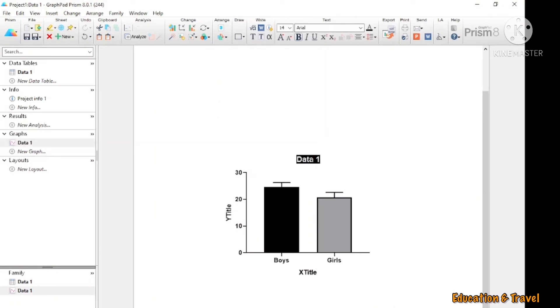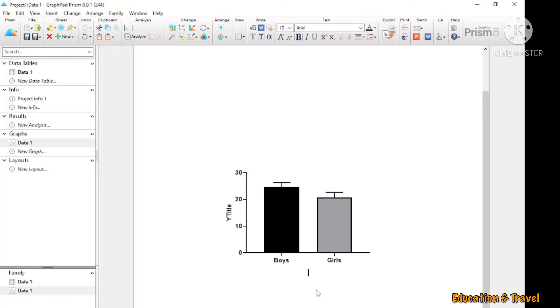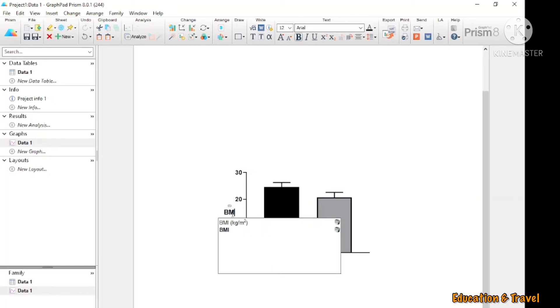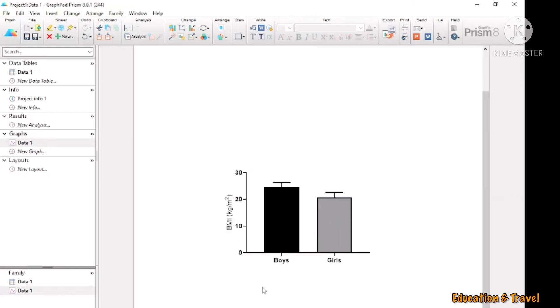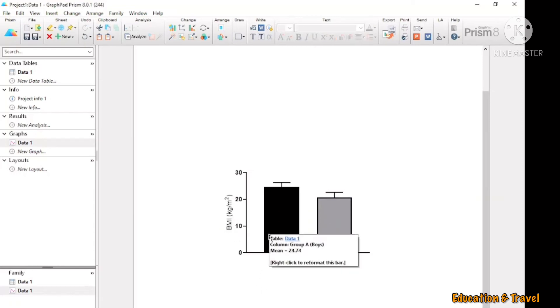You don't need to use this element, so delete it. In here, there is no title — click Edit, then delete it. In here I want to mention that this is the BMI and the unit of the BMI. This is the graph.